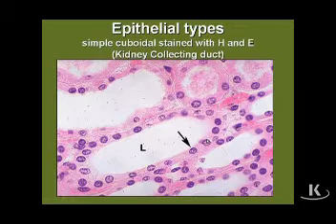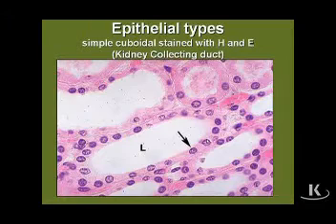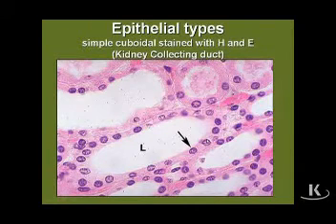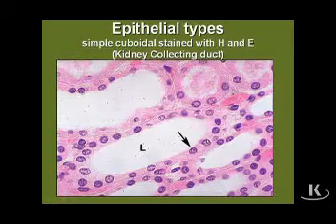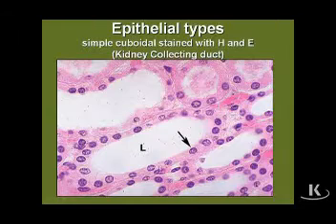The first example is simple cuboidal epithelium, which is highly characteristic of the tubules that make up the kidney. This particular view shows a collecting duct with a classic cuboidal epithelium and fairly well-recognized cell boundaries that constitute the lining epithelium.